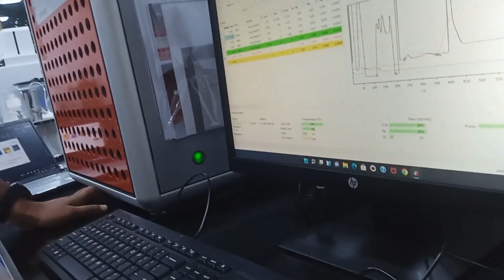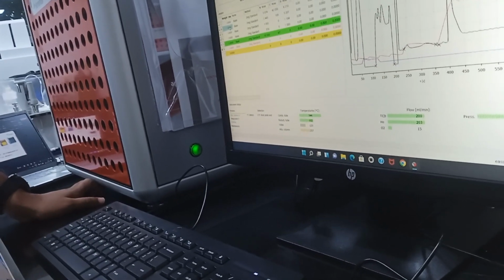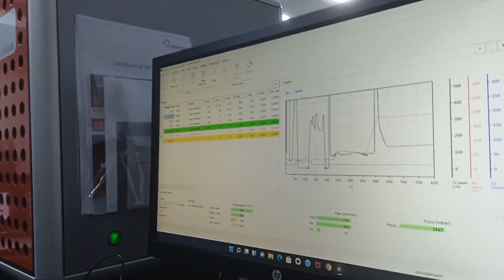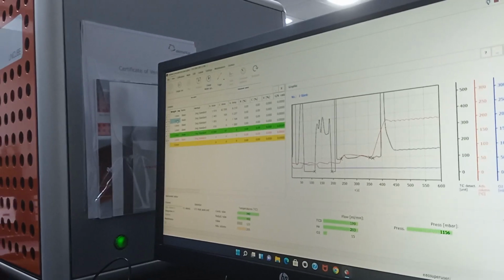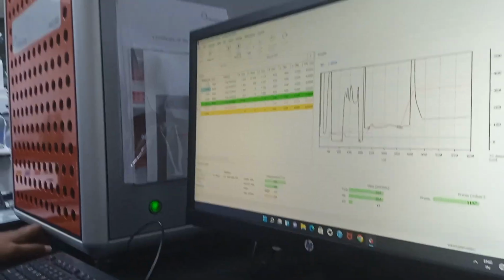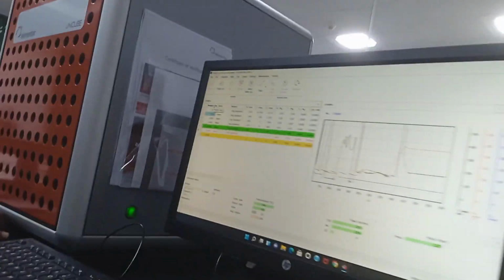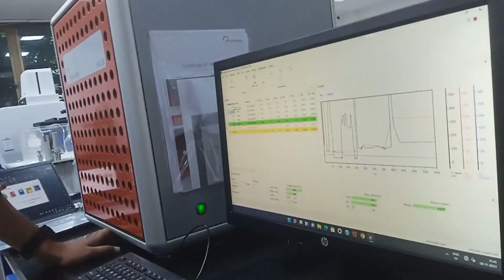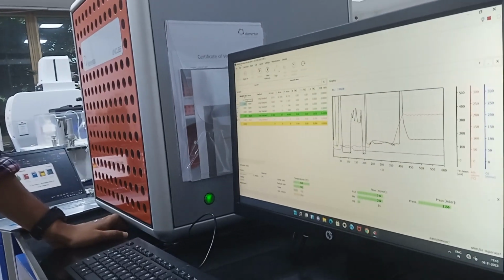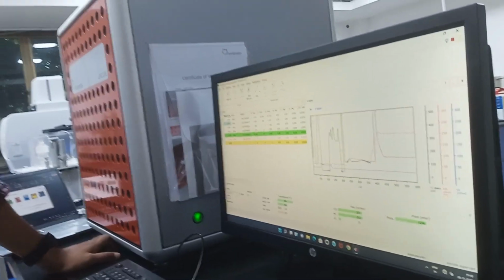With respect to that, if you keep it 1. What do you want to try to prove if you are putting 2? No, I'm just asking, if we want to change it by accident, it doesn't affect anything. Why do you want to put 2? I am asking. For example, if the sample weight is also 2, and the weight doesn't come like that.